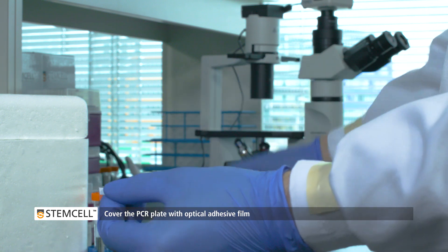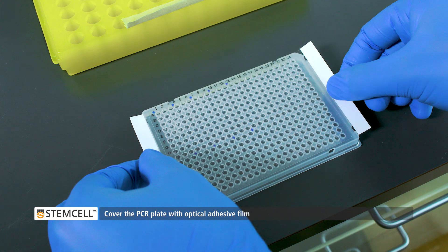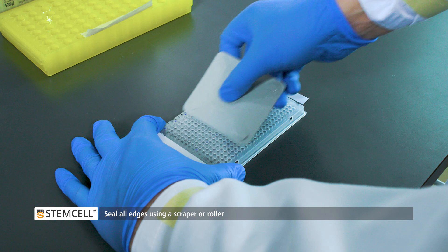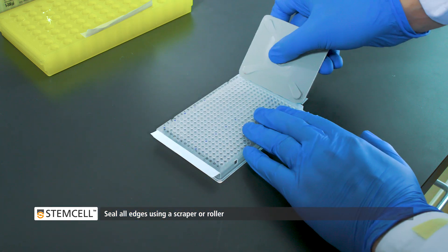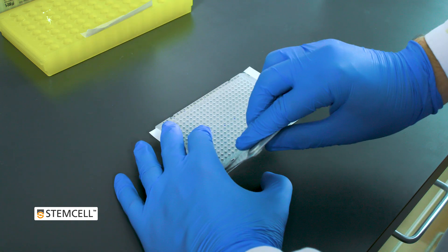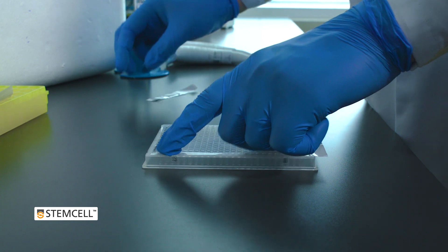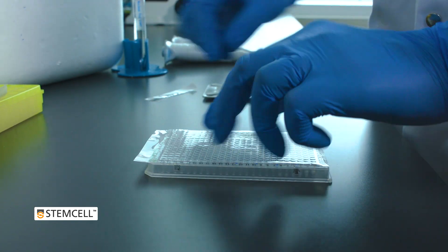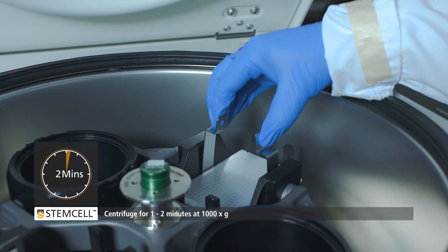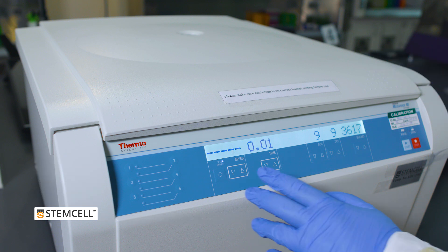Once both components have been added, cover the plate using optical adhesive film. Make sure all edges and wells are sealed properly using a scraper or roller. Then centrifuge for 1 to 2 minutes at 1000 times G to collect each reaction at the bottom of the wells.